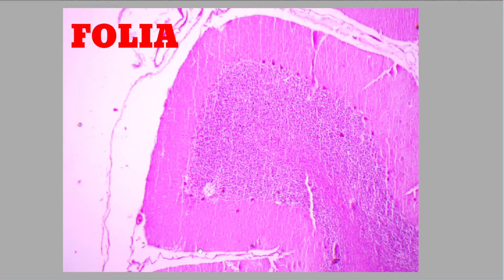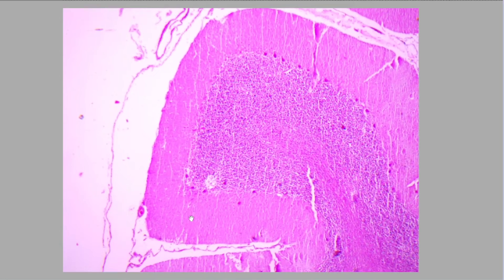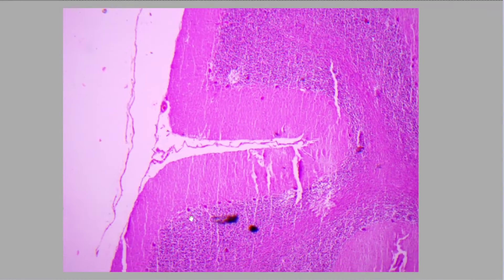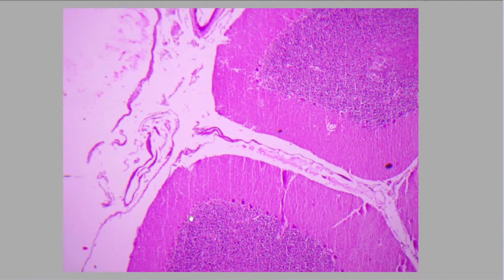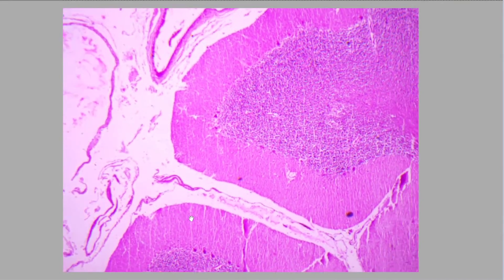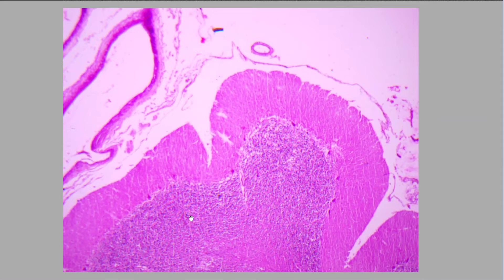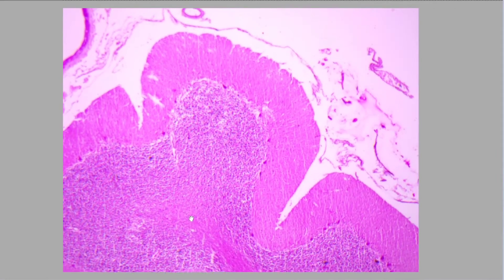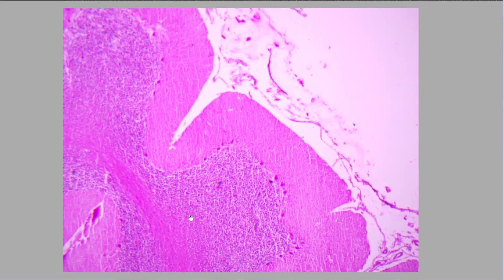In this slide you can see that this is one folia. This projection which is visible right now under 4x is a folia. If you move the slide, you can see more folia — there is one more folia adjacent to this, and another on the other side. So keep in mind that there are multiple folds just like plications, and these folds are known as folia.